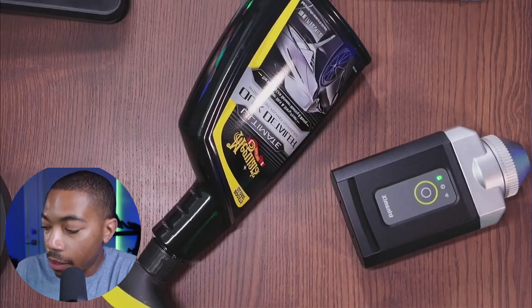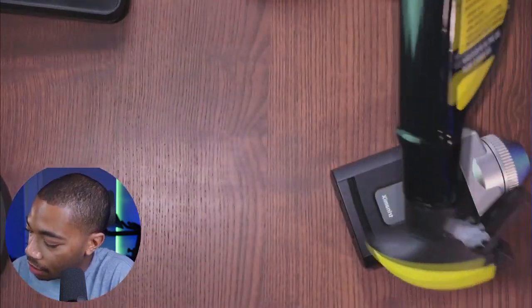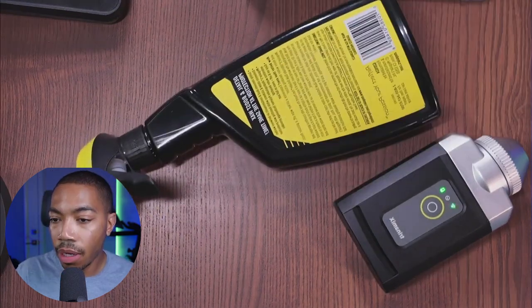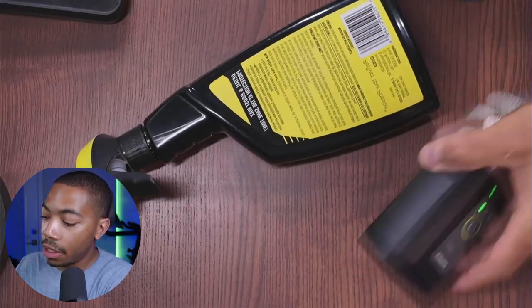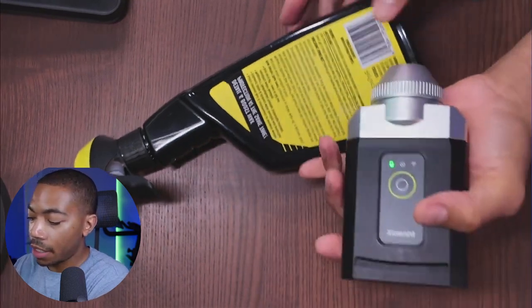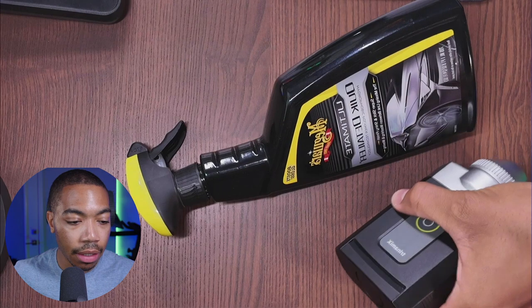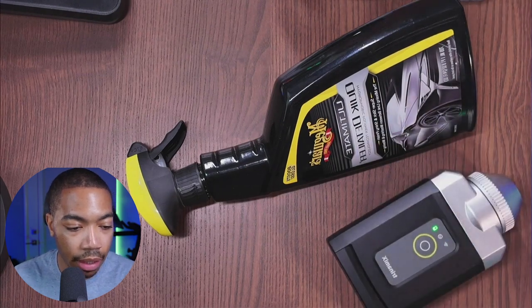So we also have some things that could pose for an interesting observation here. So we have a black container. It is recycle number 3, which is polyvinyl chloride. So let's record that. So definitely not a food grade plastic. And the fact that it's black could pose challenges for a device that relies a lot on optics, as black will absorb. So we'll still collect that data, but let me also update the app.